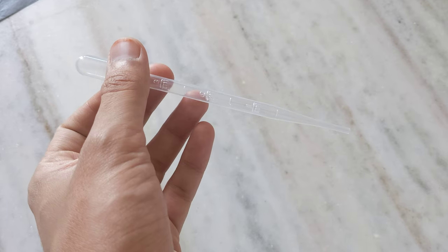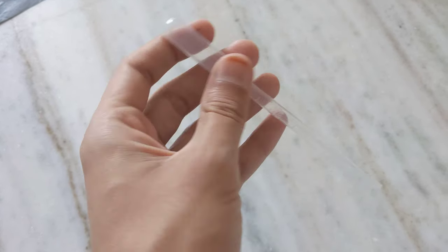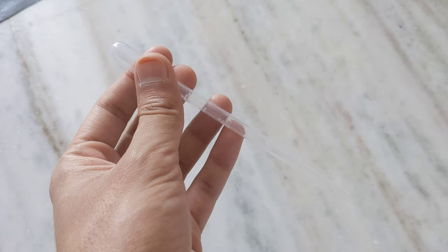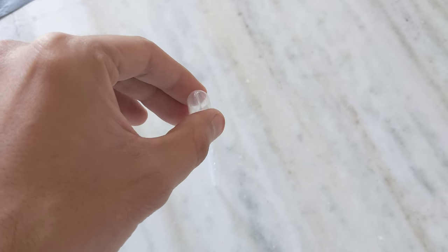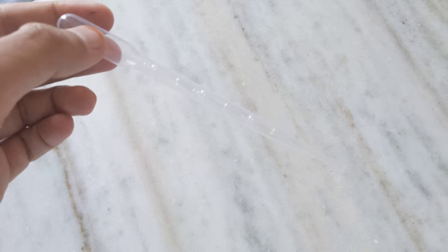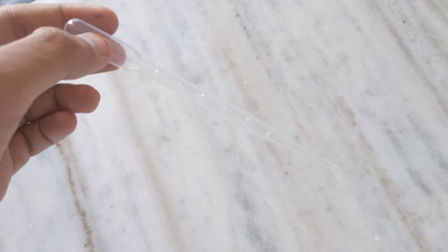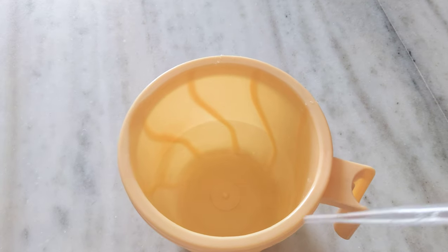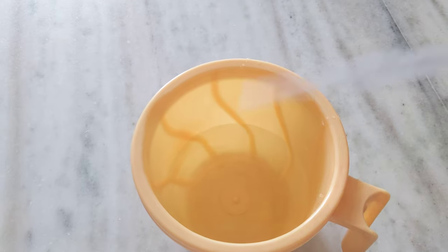So these are some of the uses of a pipette — there can be multiple uses. To use it, we just put it in the liquid, press it, then release the press to fill the liquid in. Let me show a quick demo. For the demo, I have a mug filled with some water.